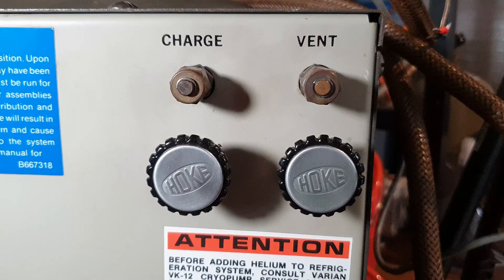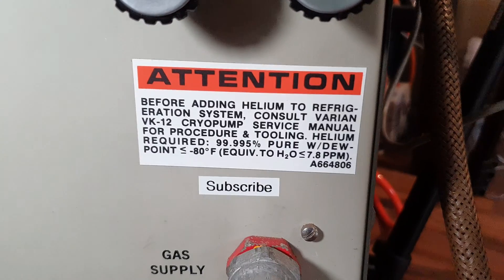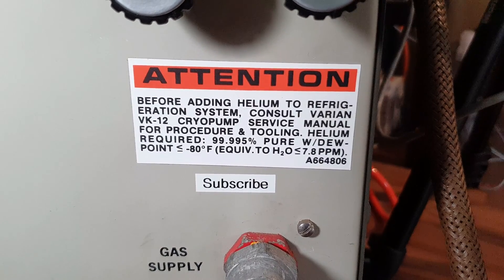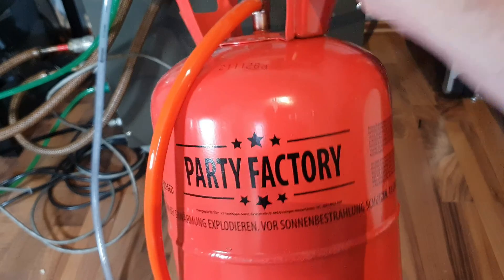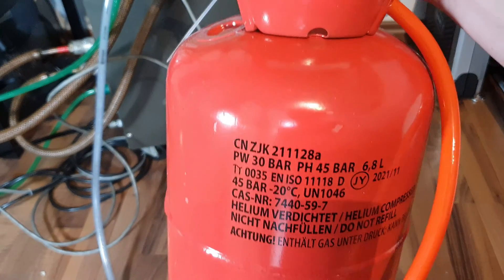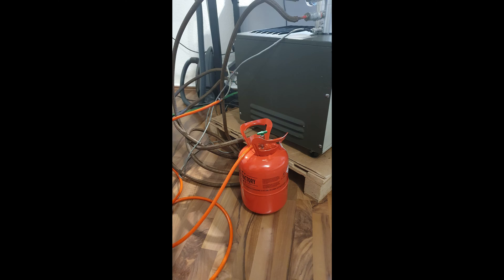The compressor has a charge port; according to the label below it wants 99.995% pure helium. So it's quite convenient that there is helium for balloons available that is 99.996% pure. So I got myself some proper party factory helium certified for the use in cryopumps. Because I did not have the correct connectors I botched together a more than questionable construction to refill the compressor. And after turning it back on, it finally worked.